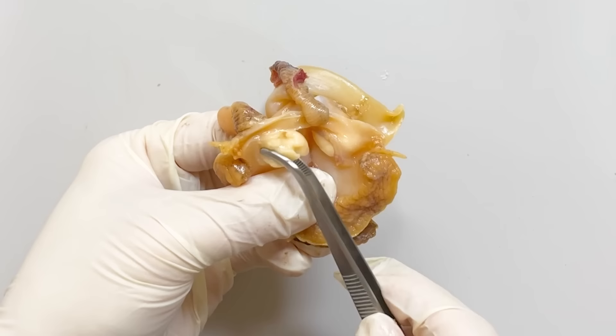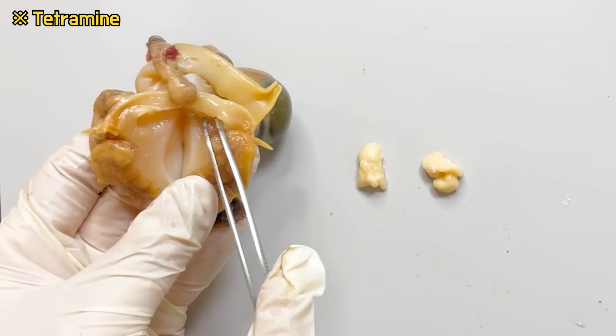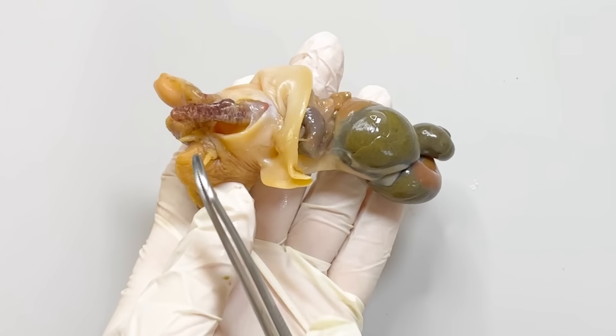To eat whelk, it's essential to remove these salivary glands, because some species produce a toxin called tetramine in their salivary glands. The digestive tract loops around and extends towards the head.